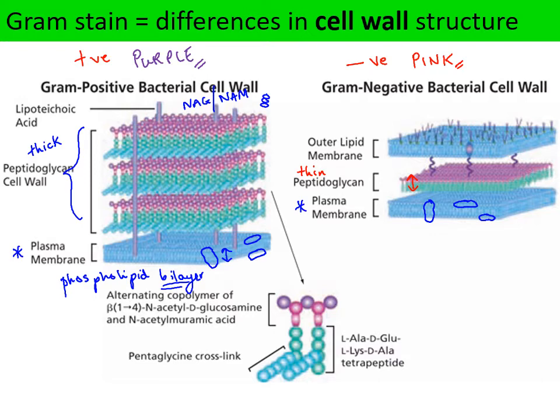Then there's a little bit of a space, and on the outside of the thin layer of peptidoglycan is an outer lipopolysaccharide layer.